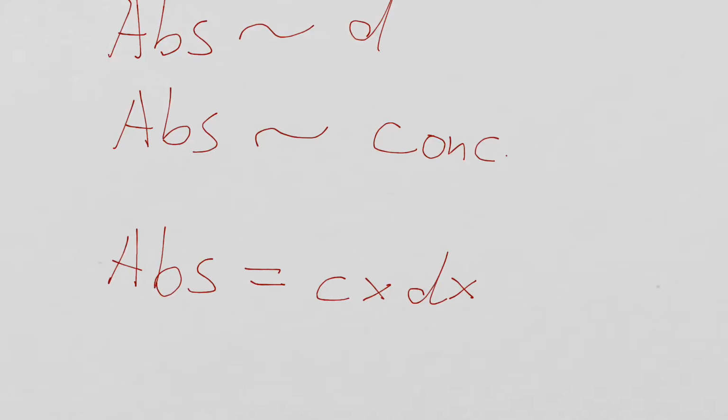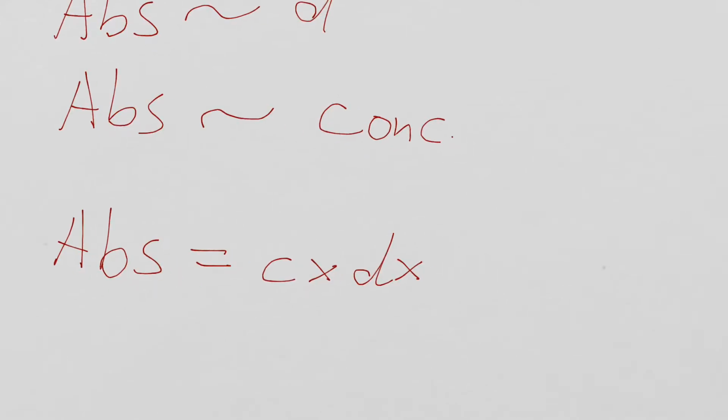And in our case, we call this factor epsilon. It's the Greek epsilon, which stands for extinction coefficient.